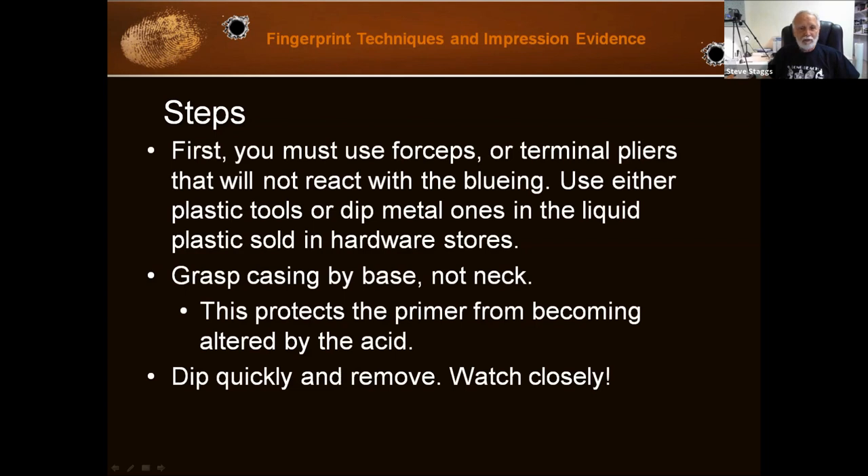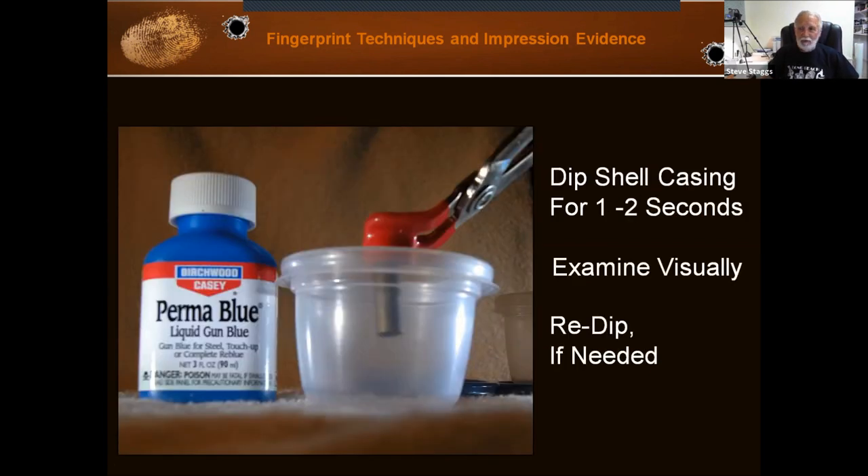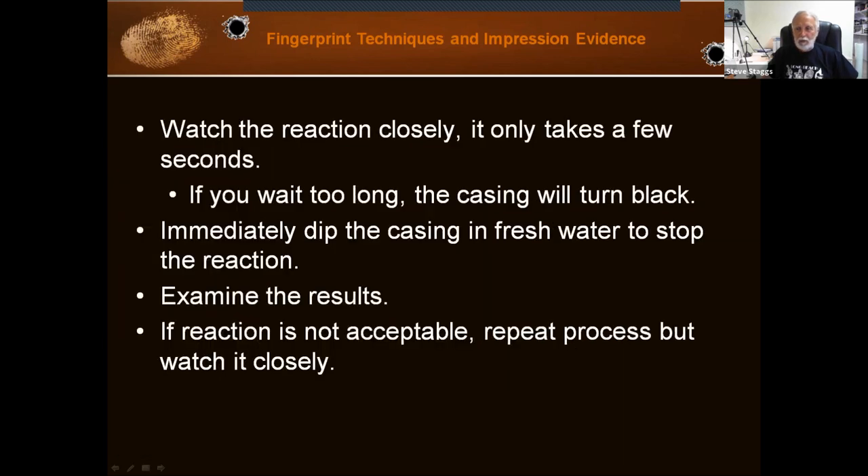Grasp the casing by the base, not the neck. You don't want to damage the primer and you don't want to get any of that acid on the primer, because there's some acid involved here. Dip quickly, remove, watch it, and redip as necessary. Here we go — dip the shell casing for one to two seconds, examine it, then redip as necessary. You can see we're holding it with terminal pliers coated with plastic so they won't contribute to any reaction. Watch the reaction closely; it only takes a few seconds.